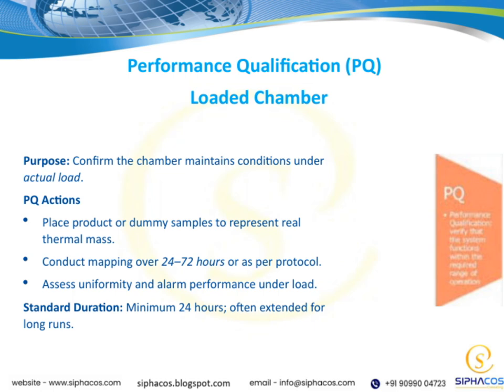Overall, this step helps us verify that the chamber can sustain the necessary conditions consistently, which is vital for product quality and regulatory compliance. It ties back to our overall goal of ensuring the integrity and reliability of our processes.